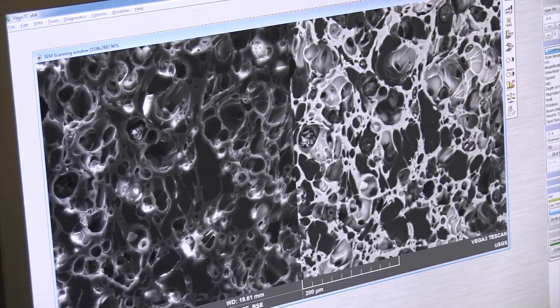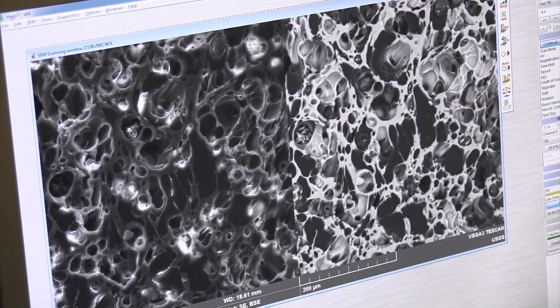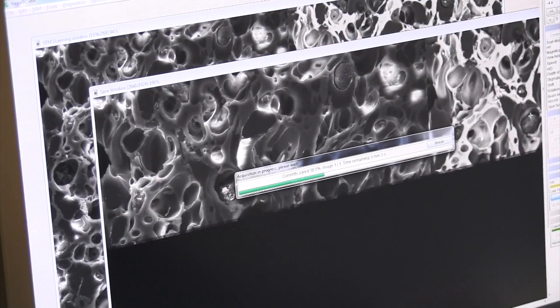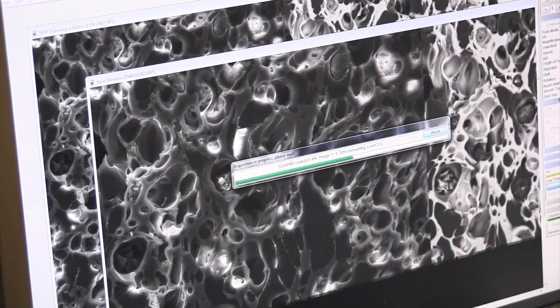All the different groups at the USGS use our SEM. We image everything from soils, sands, fossils and microfossils, organic material, microbes, material produced during and around fault zones, and material produced during volcanic eruptions — volcanic glass and minerals and the little vesicles that contained volcanic gases during the explosion. So pretty much anything having to do with geology can go in our SEM.